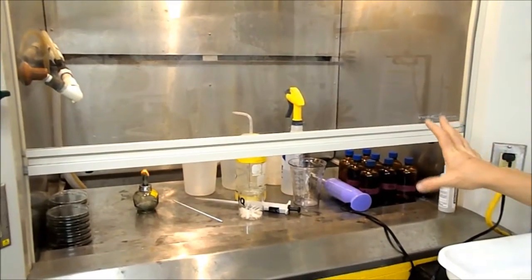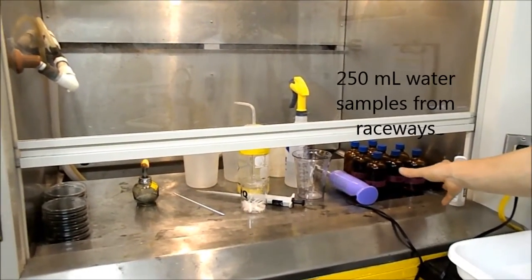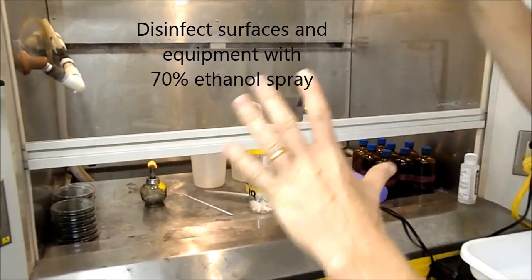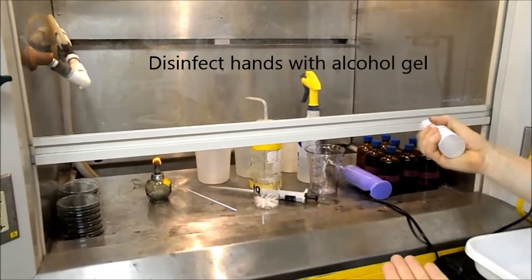We're going to plate up to do Vibrio counts on these plates. I've got our water samples on this side, there's about 250 mils. I've sterilised everything with 70% alcohol, sprayed it over the whole thing. Sterilised my hands before I start as well, just with alcohol gel.